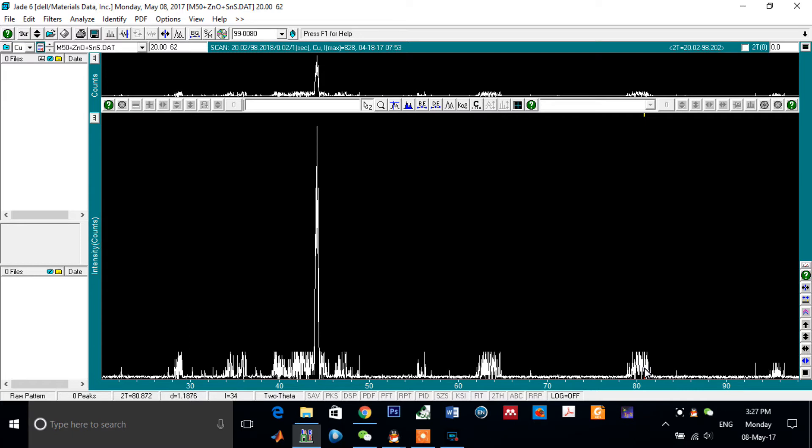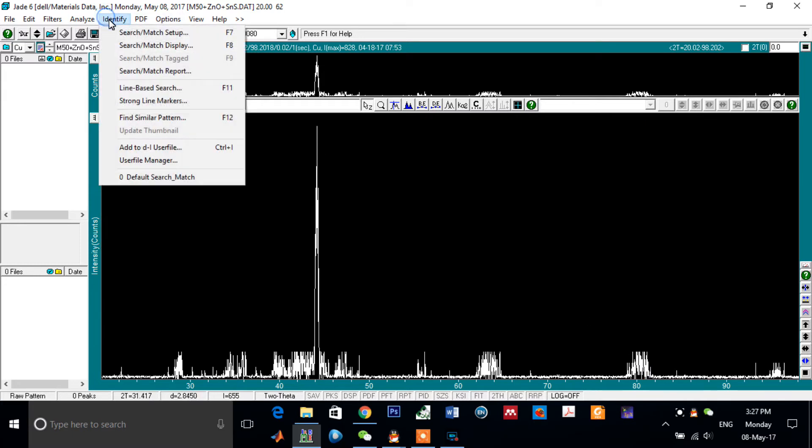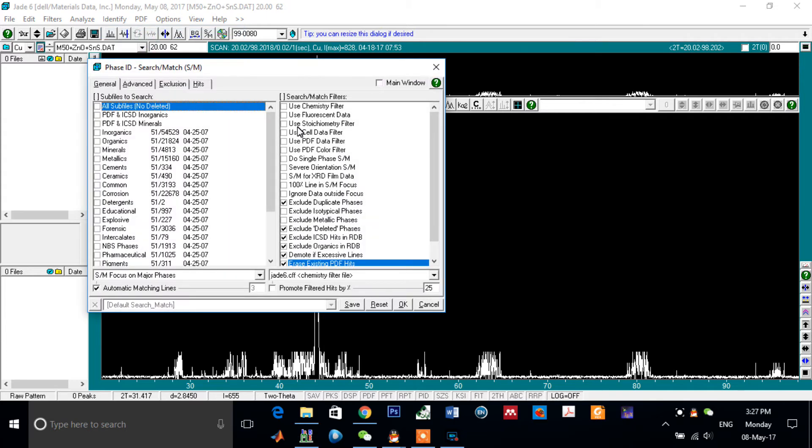To know what these peaks are, just click on Identify, Search, Match, Setup.